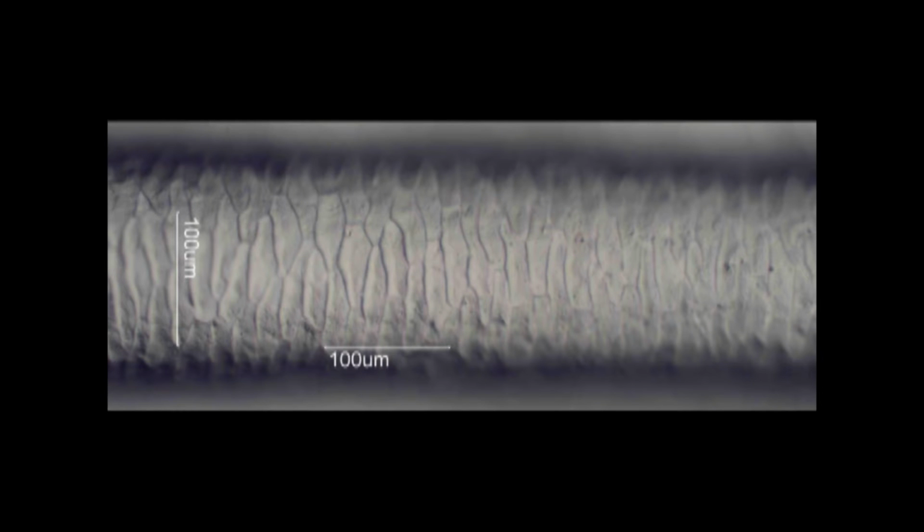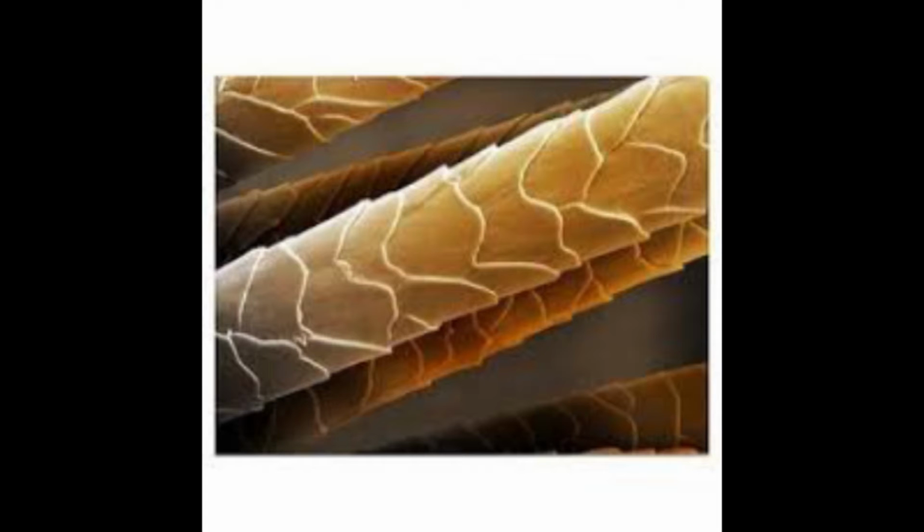Imbricate, mostly found in humans. Spinous, mostly found in minks, cats, and seals. Coronal, mostly found in small rodents, bats, and sheep.